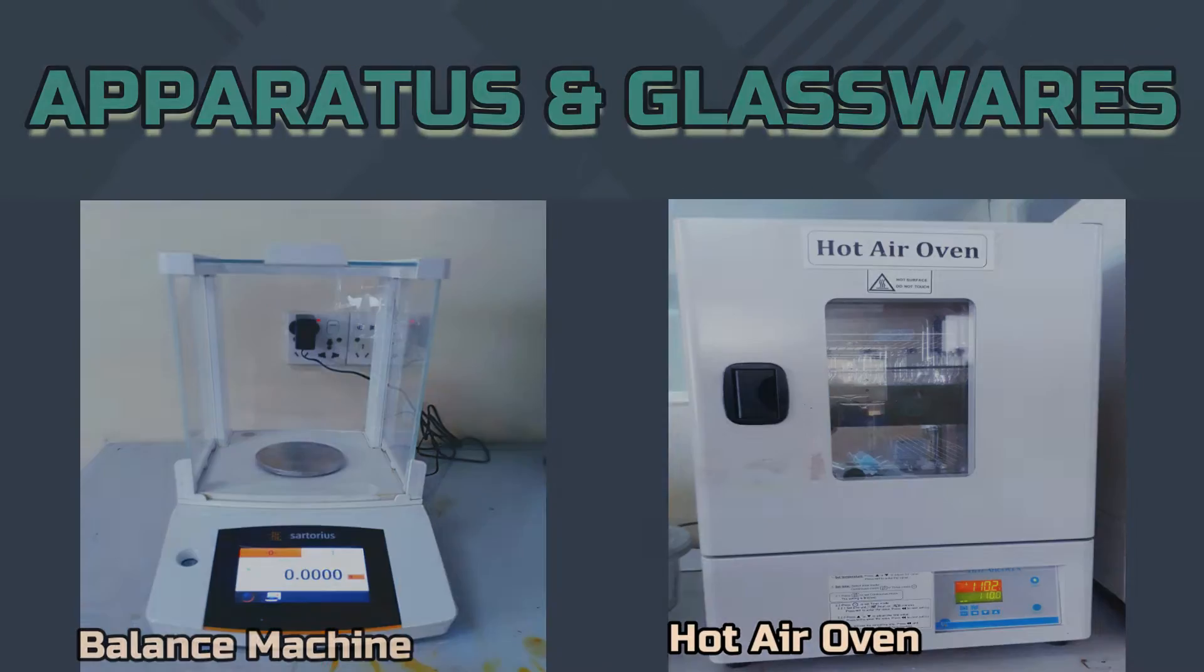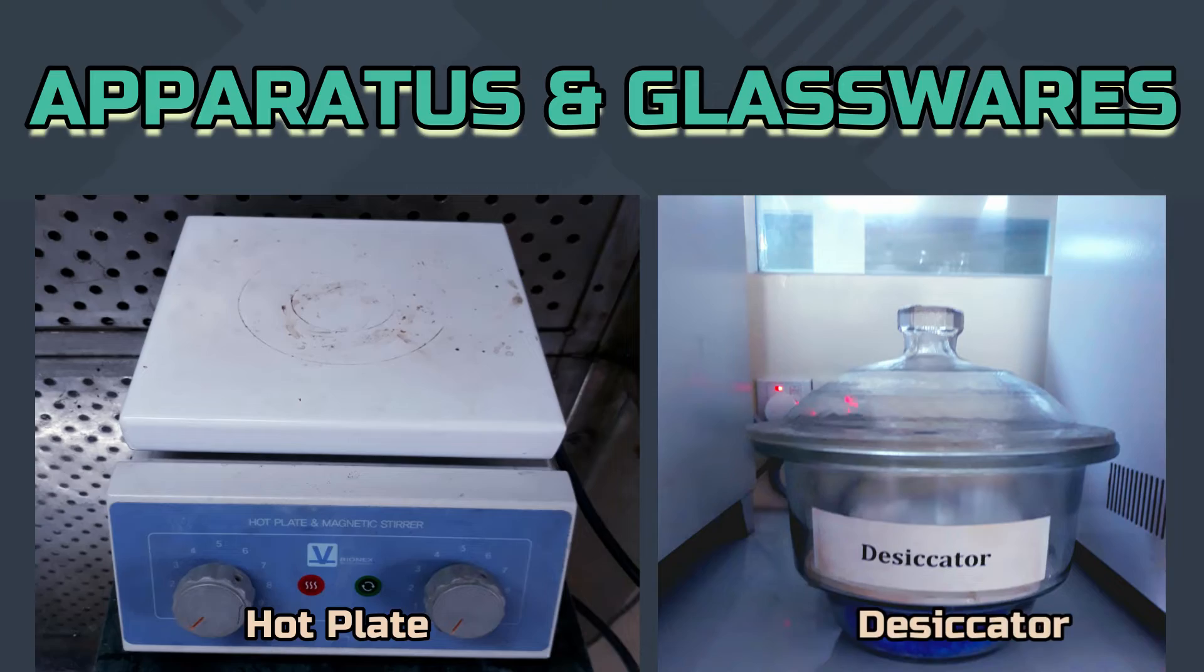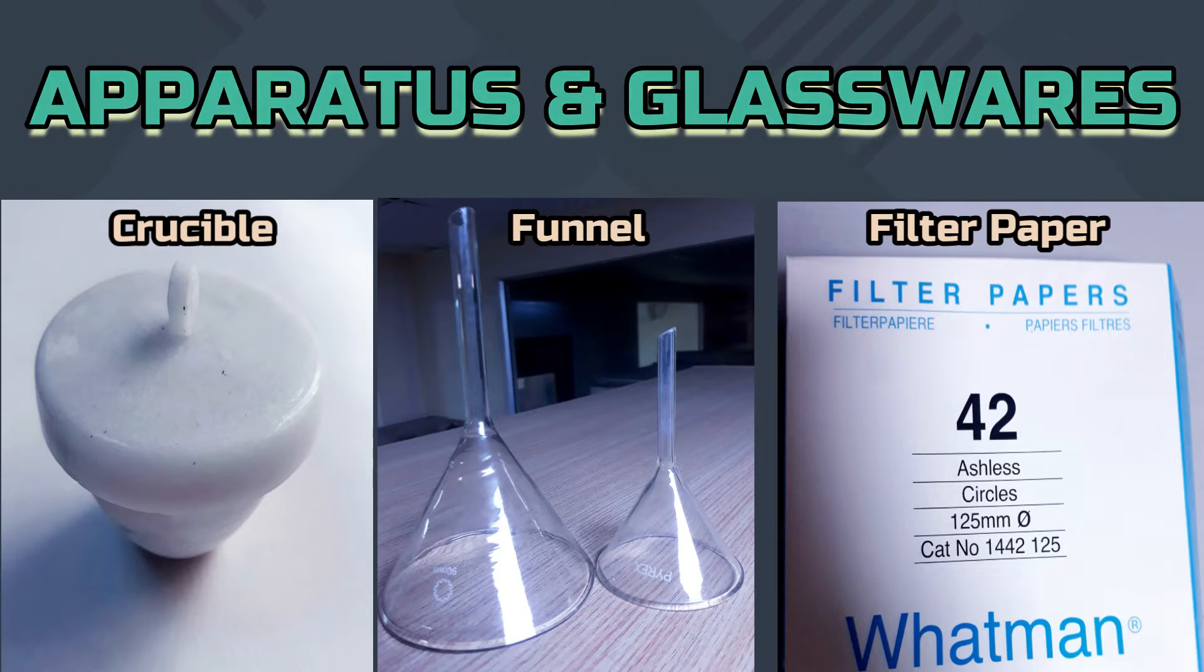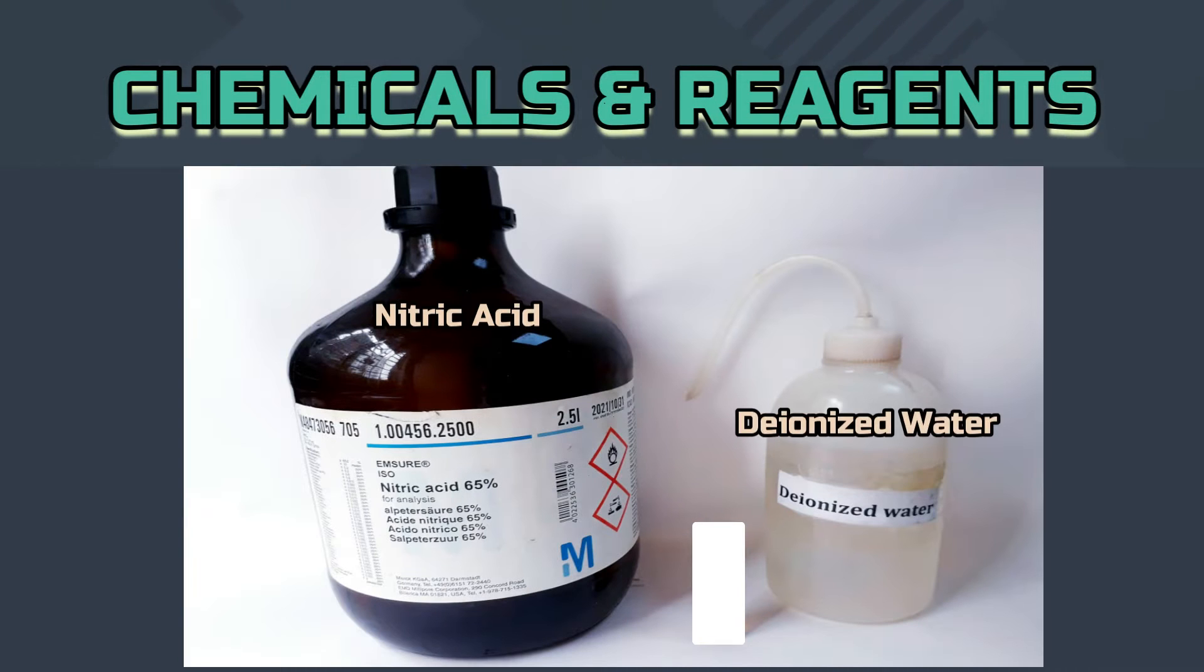To prepare a sample, we need a balance machine, hot air oven, hot plate, desiccator, muffle furnace, volumetric flask, crucible, funnel, filter paper, nitric acid and deionized water.